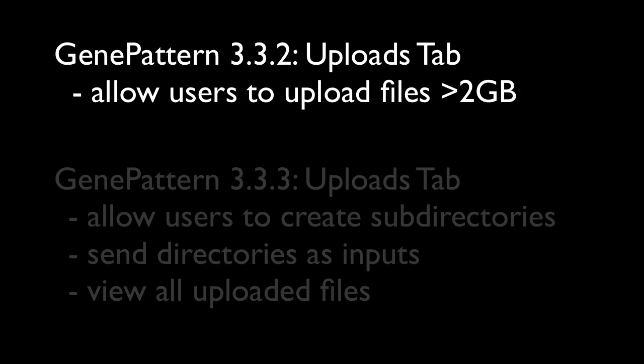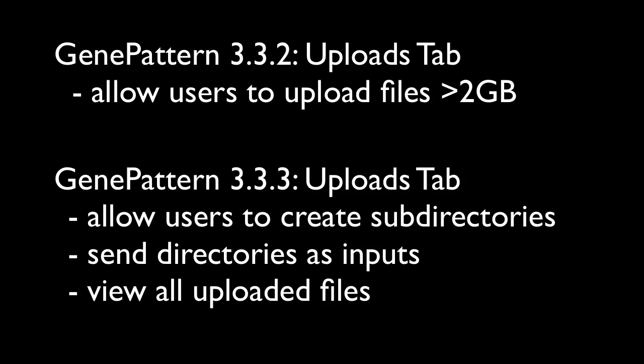In GenePattern 3.3.3, improvements were made to the Uploads tab, allowing users to add subdirectories within the tab, send directories to module inputs, and view all uploaded files.